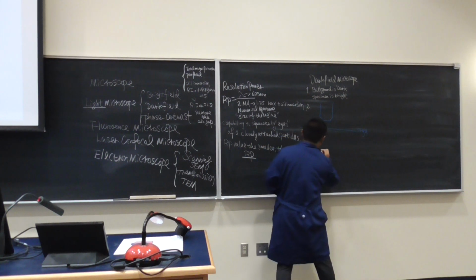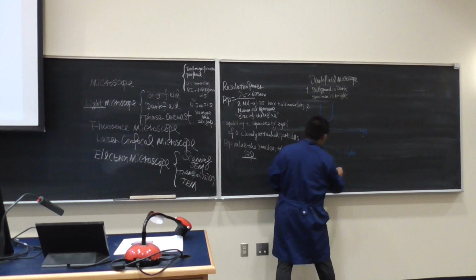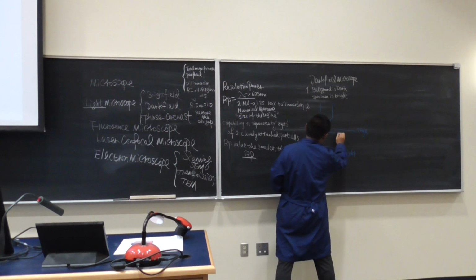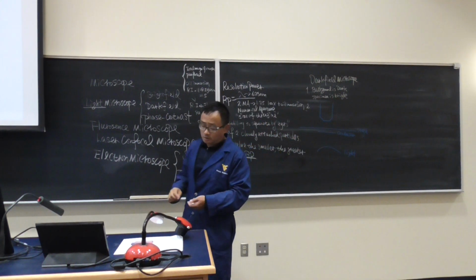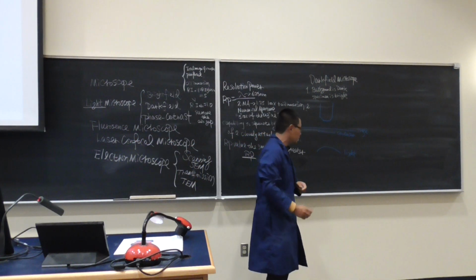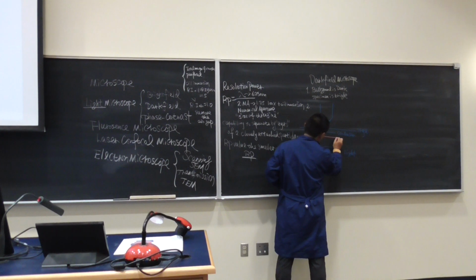And then we have the light source right here. And we have a condenser somewhere right here. It's a condenser. So what happened is, in the space between the condenser and the light source, they put a solid block there.